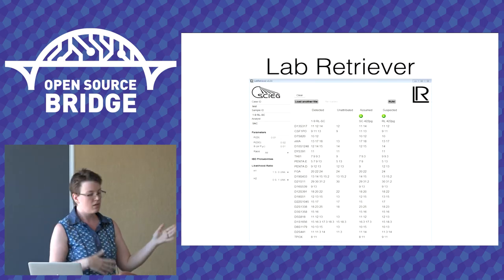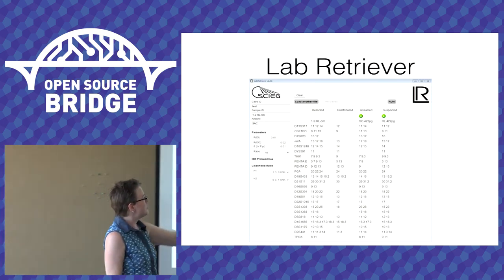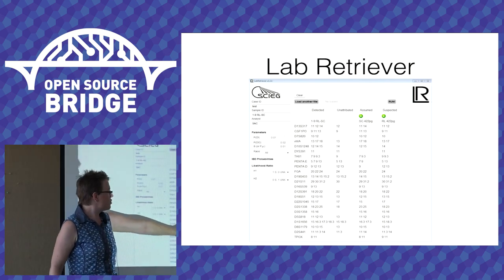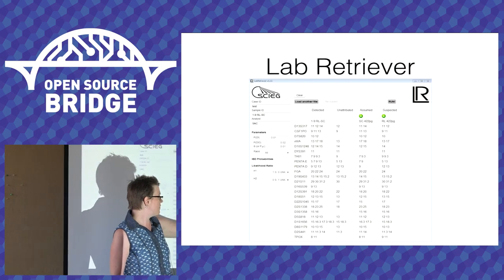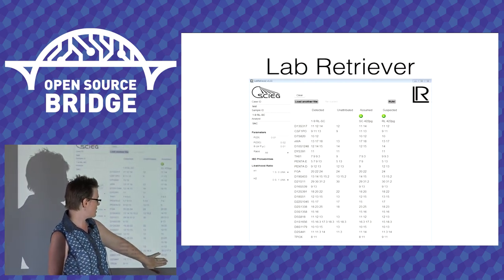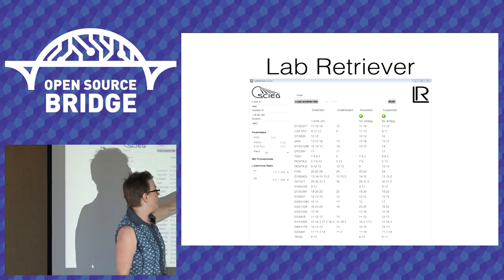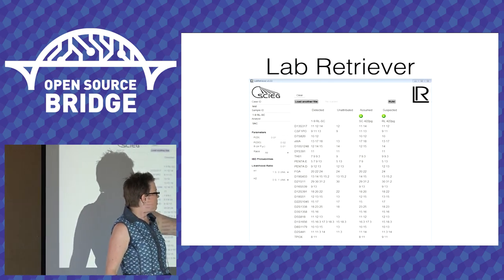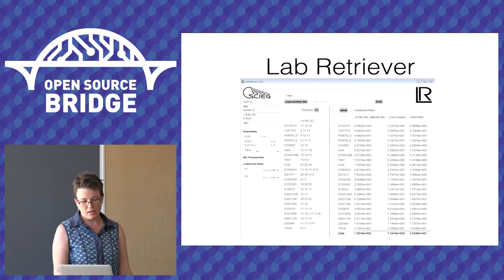Okay. I plug in magical numbers that you can't read. Here's the DNA profile, the mixture of me and Robert that was incomplete. I tell it, look, this is the victim. This is me. I am totally in this mixture. It was a swab from my own skin. I know I'm in this mixture. But what about Bob? Do you think Bob could fit into this mixture? Clickety-click.